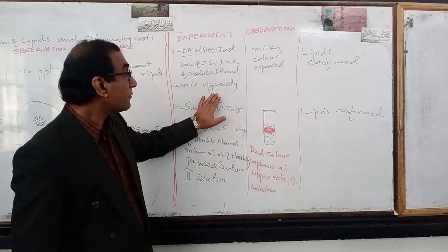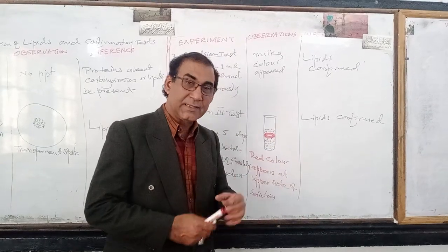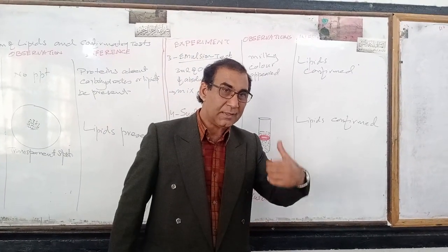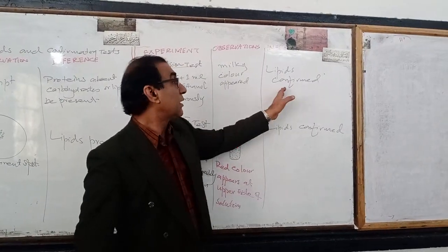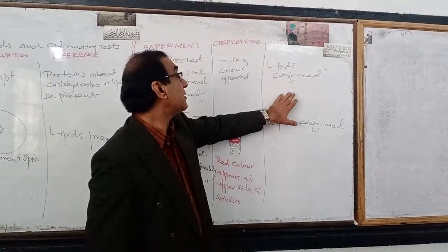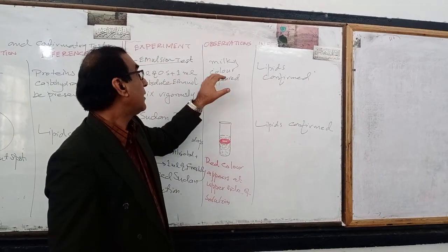Well, a milky appearance forms in the test tube. That becomes like milk has been mixed in it. So that is how the lipids are confirmed. The inference would be: if you observe the milky appearance, lipids are present.